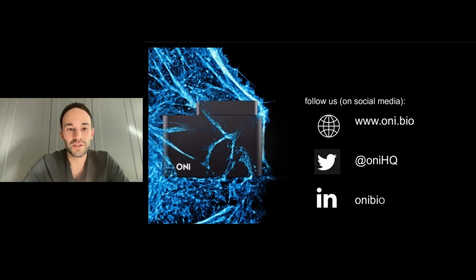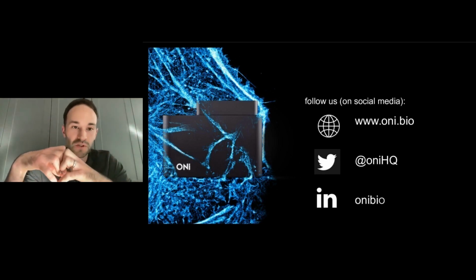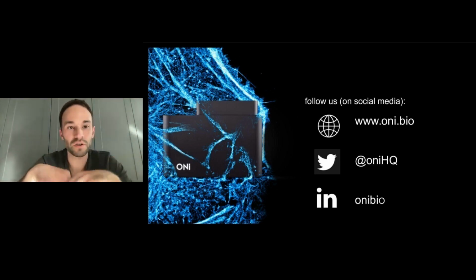One is it means that the rate of incorporation is often not good. Generally, when you use lipid dyes to stain a cell, it's not free dye molecules inserting into the plasma membrane of the cell. It is a fusion event between the micelle and the cell itself. So there aren't many free molecules floating around, which means it's quite challenging to get the EV and the micelle to fuse, because you can imagine the curvature is a block.